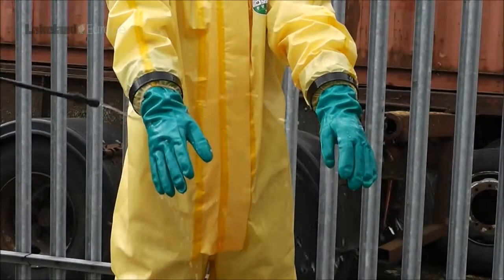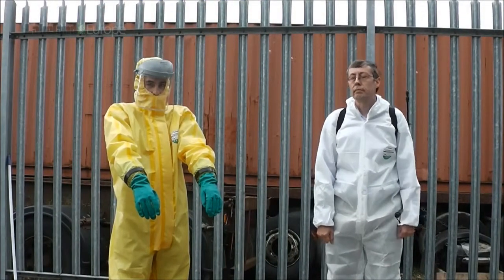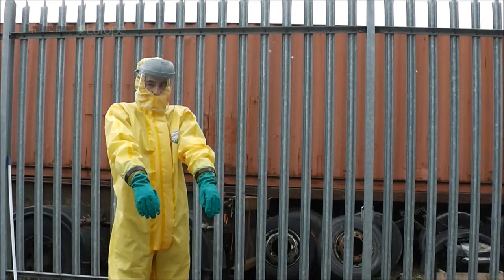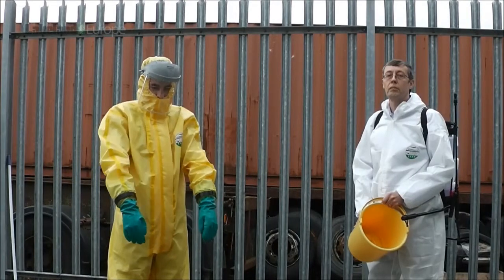John was encouraged to spray at the glove connection from different angles. To make an even tougher test for the system, we asked John to fetch a bucket of water — we meant for Romain to dip his hands into, John.